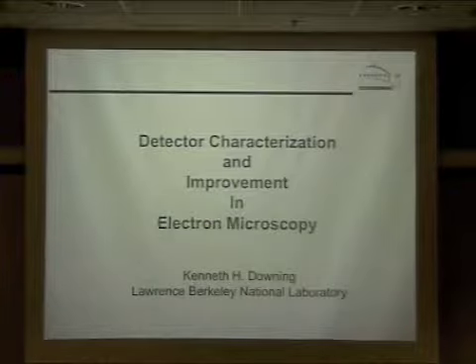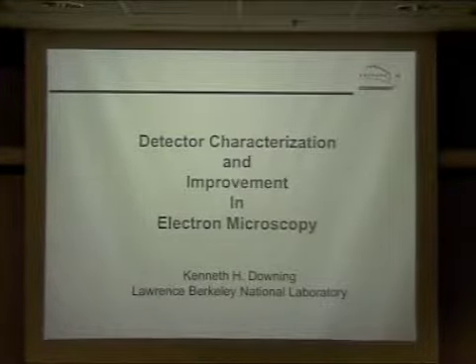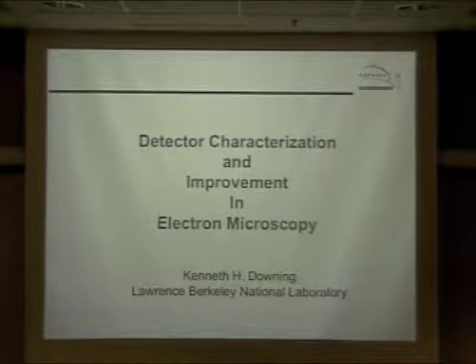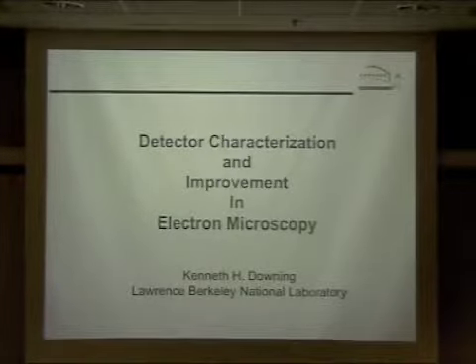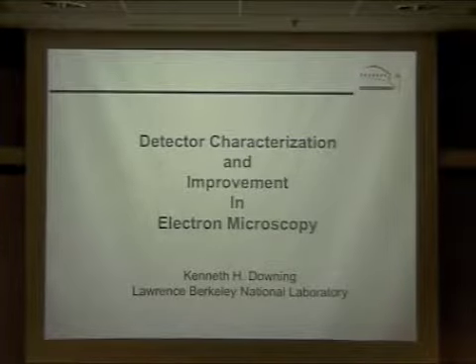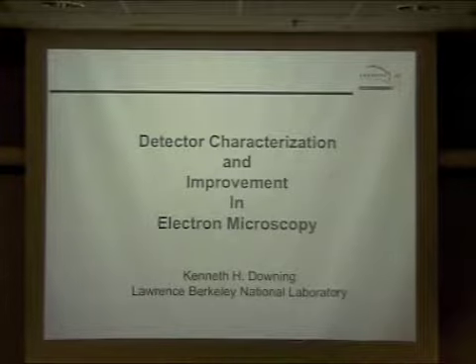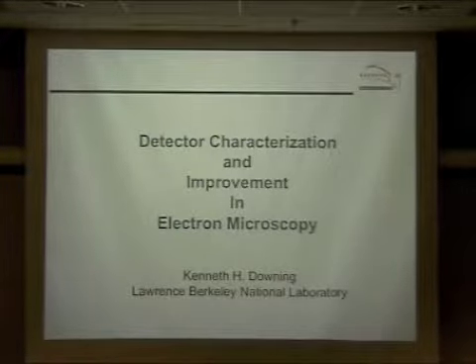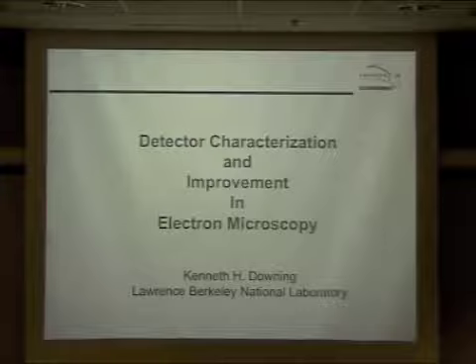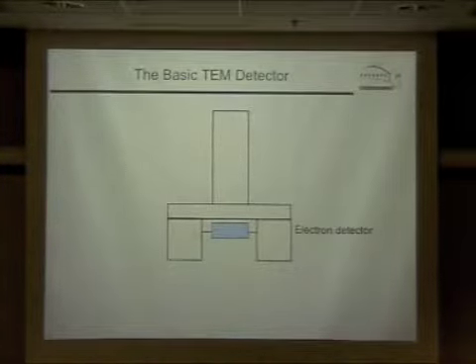And in any case, we often don't work with the lowest orders of the diffraction data. And so I think maybe there's not quite the same need for the phase contrast. But we still have needs that are at least as great as everybody else for things like electron detection. And that's the focus of this talk here.